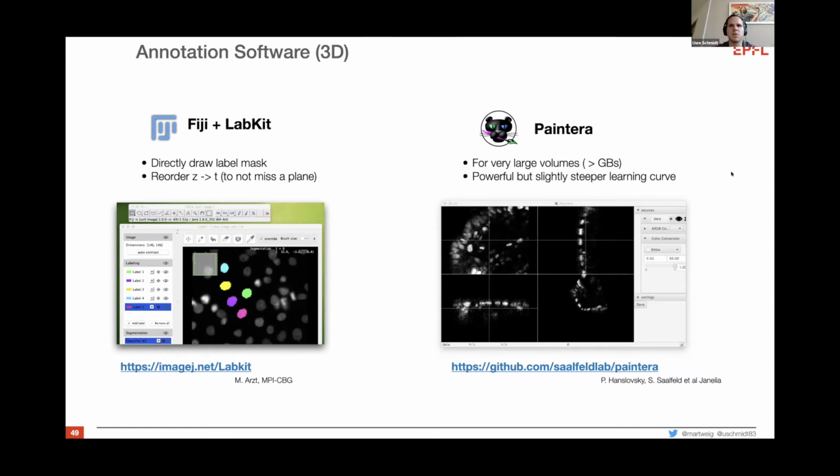But yeah, sometimes it's a combinatorial thing, right? Sometimes you have multiple things that may match together, right? And what do you do then? So if you do it in the greedy way, slice by slice, then it might not be optimal, right? It's a bit of a tricky problem in some cases, maybe.